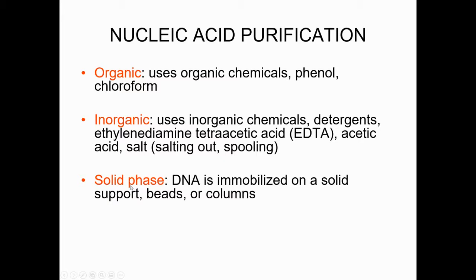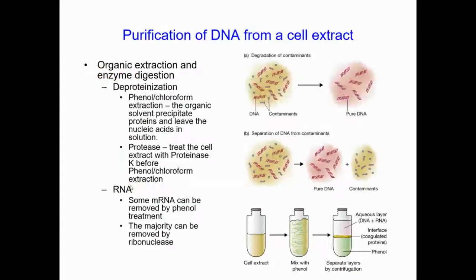All right, and then so basically the supernatant goes through the column, and then the column will bind the DNA, and later on you can elute the DNA, right? So this is the method using the phenol-chloroform. So the idea is the phenol will be able to precipitate a protein.